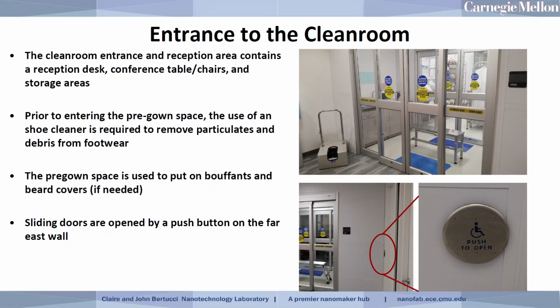I should mention that the expectation when you're coming to the lab is that you have lab appropriate clothes and shoes on in terms of cleanliness. So, particularly as we get into rainy seasons in Pittsburgh and the winter season where you may have dirtier footwear, we ask that you really be diligent about wiping your feet outside in the cafe area, where we also have a little brush that you can push your foot up against in order to remove bulk particulates before you come in here to use the automatic shoe cleaner.